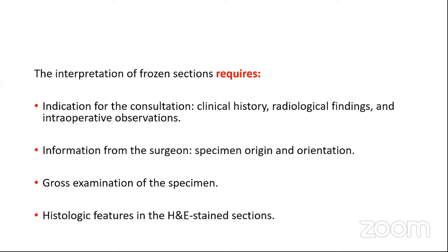The frozen section procedure is teamwork. It requires collaboration of multiple departments: histopathology, radiology, surgery, and the nursing team. The indication for consultation has to be known to us: clinical history, radiologic findings, and intraoperative observations. Information from surgeons, such as specimen origin and specimen orientation, is also needed.